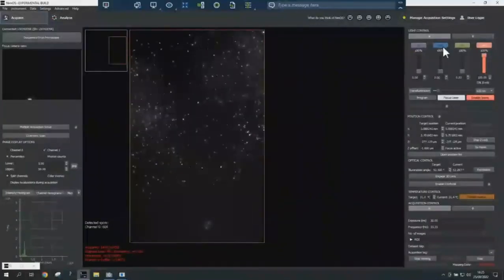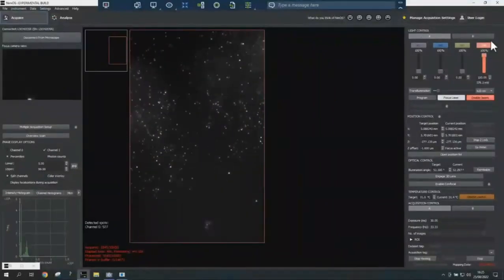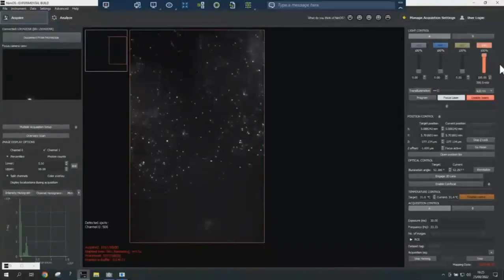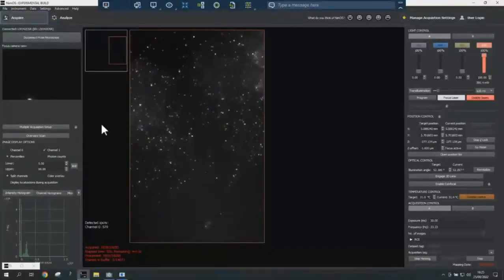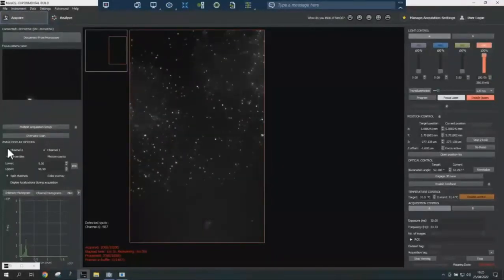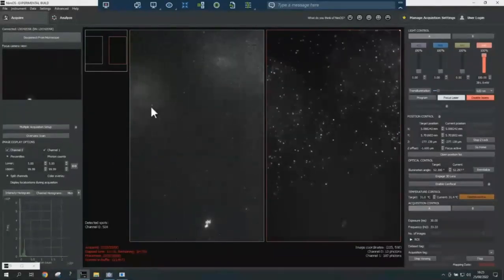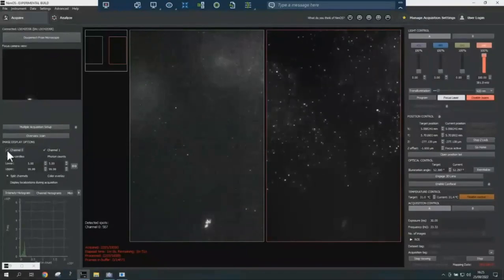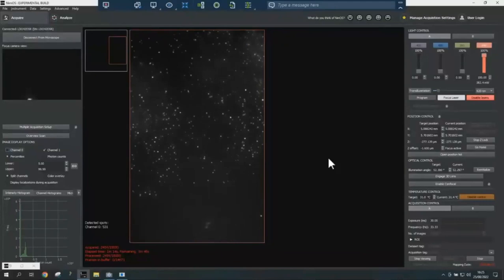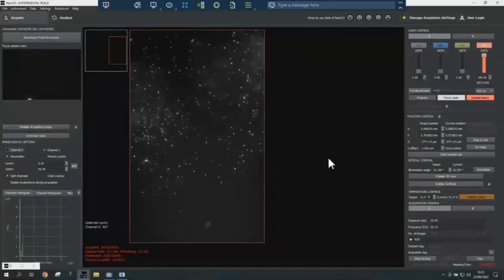So the controls of the Nanoimager are all here. We have, as my colleague Peter has explained, 4 lasers. So we have up to 4 color imaging, but 2 of them can be done simultaneously. So we have actually the chip divided in 2. If we would like to do dual color, we would turn on this part of the chip. But in this case, we're only doing 1 single color. So it's basically the same chip, but 2 optical paths. So the same field of view, but 2 colors.